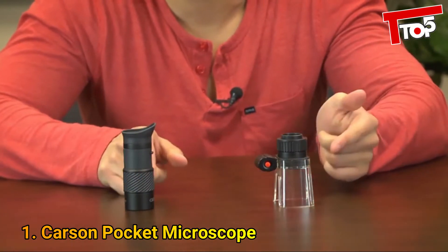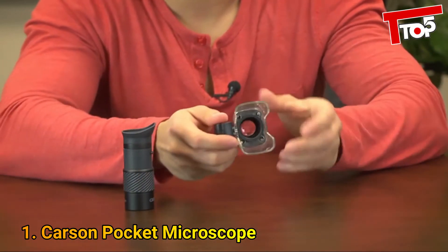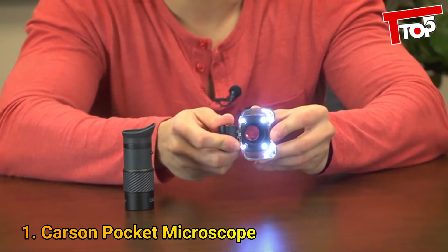All three of these are focusable, and check this out — there are four super bright LEDs built right into the see-through base.